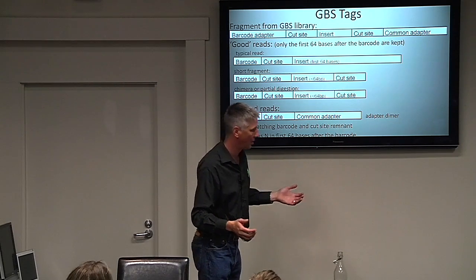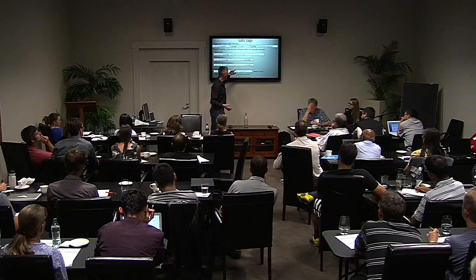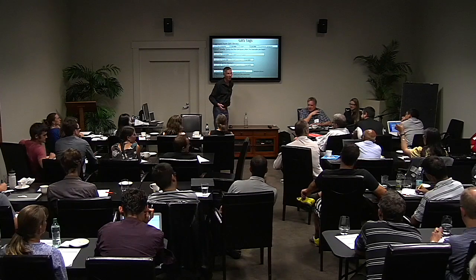What would be the adapter dimer, you mean? No, this chimera. Oh, I see. And if you had excess, you'd also get the adapter dimer. Yes, right. Well, hence the titration step.